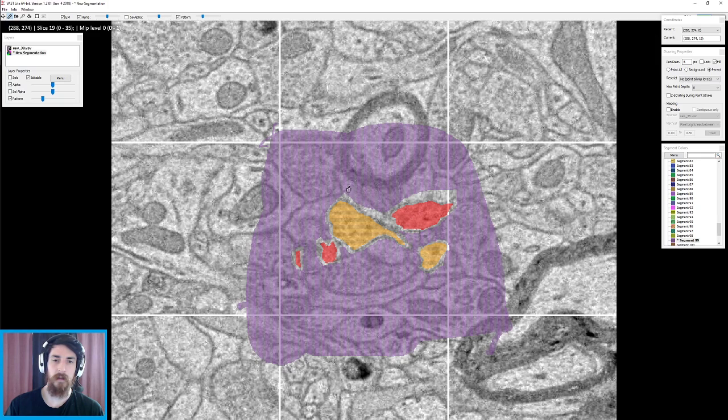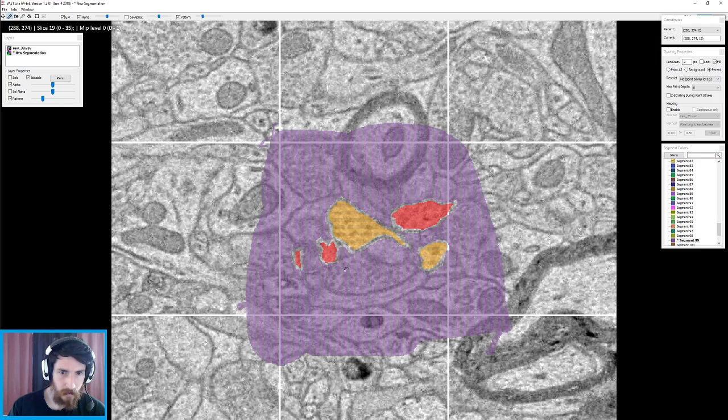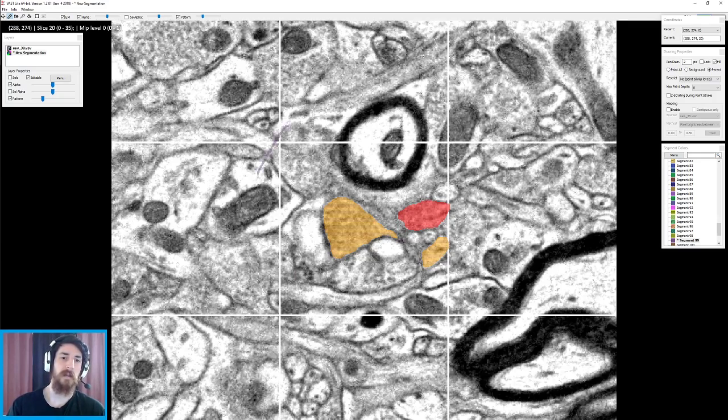This could just be like that. And this can be like that. How do I think about this? What do we think here? Let's get rid of that. Okay. There we go. We can just do that. It's not even going to be in part of the picture, but that's okay. Just for peace of mind. Let's get our big brush.